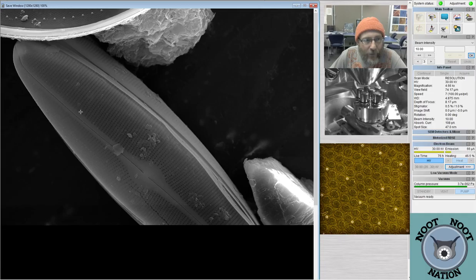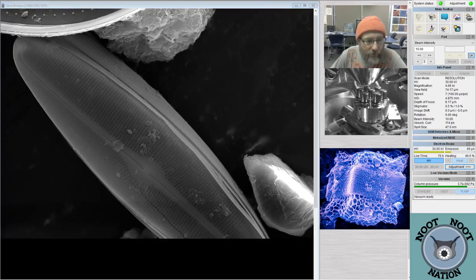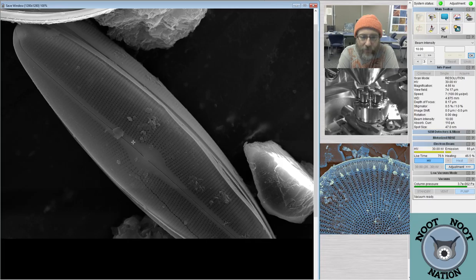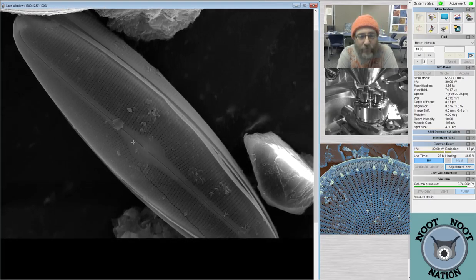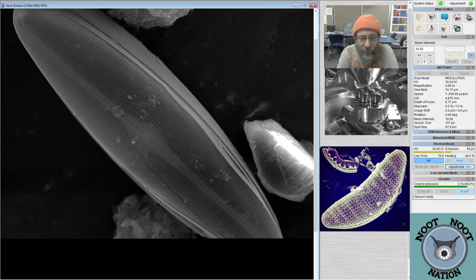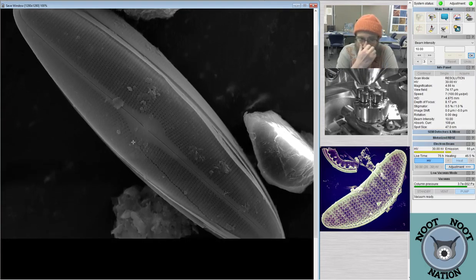Occasionally I will also put diatoms on my light microscope and stream those through Twitch as well. So you can definitely see diatoms at various size scales on light microscope in living forms. And if you come to Pacific Plankton streams, which are Monday nights and Thursday nights around midnight Eastern time, you'll get to see diatoms every time because they're always in her plankton that she collects.